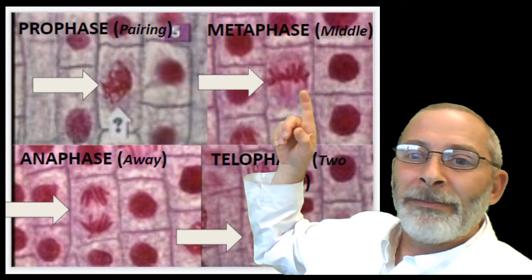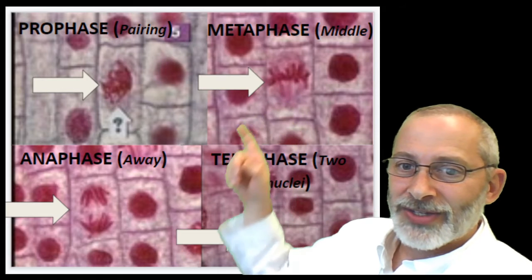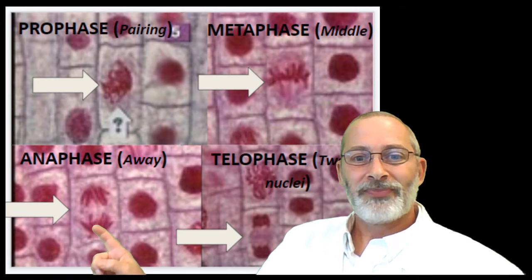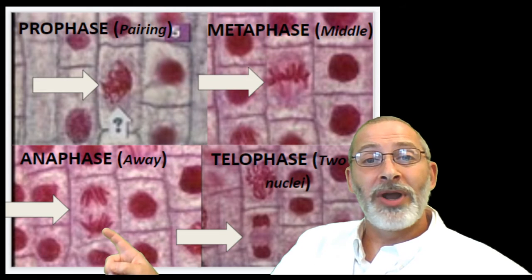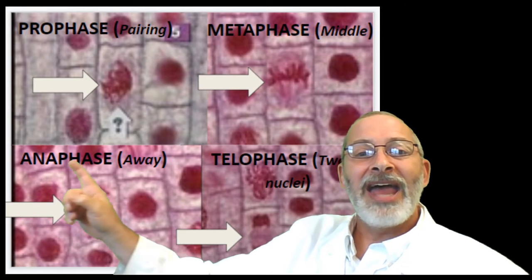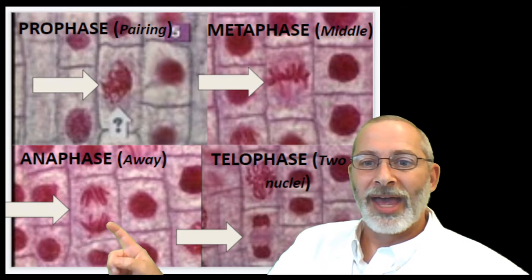Metaphase is when they meet in the middle. Metaphase. Third, we have them going away from one another or moving apart during anaphase. This is anaphase, moving away.